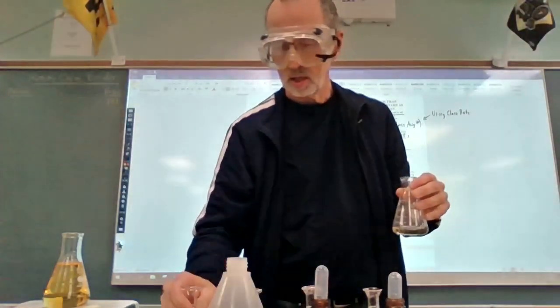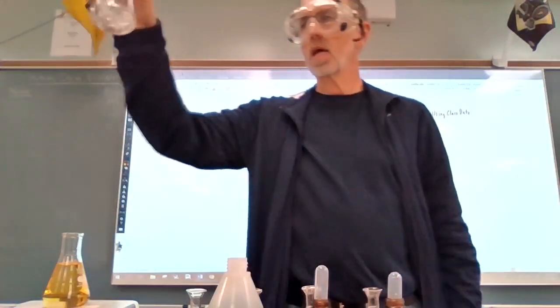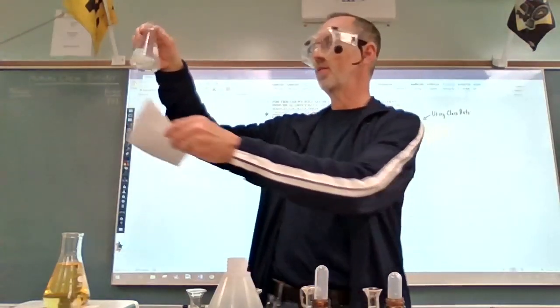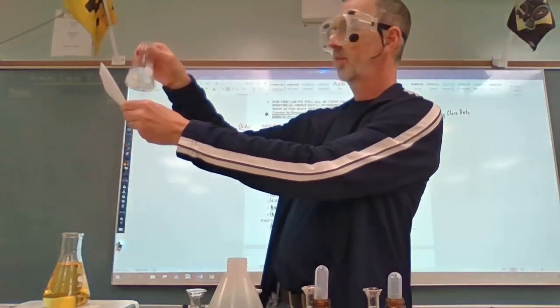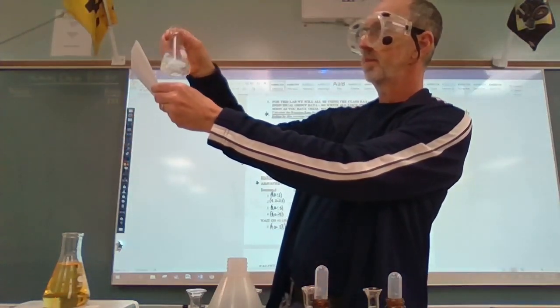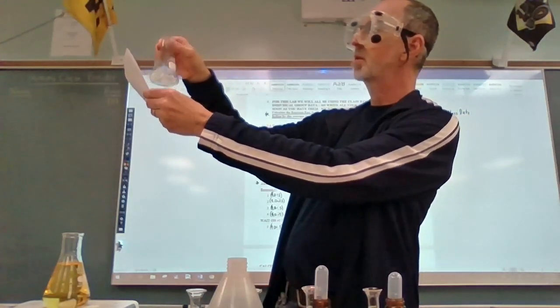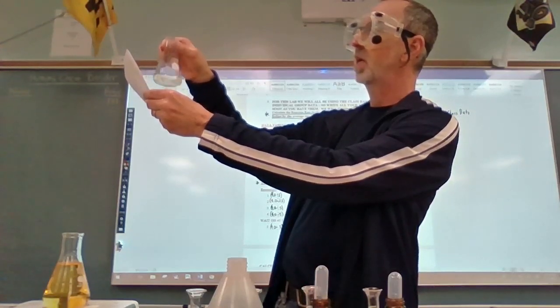Boom. And swirl the flask. Yeah, this one's going lighter, going more clear much more quickly.